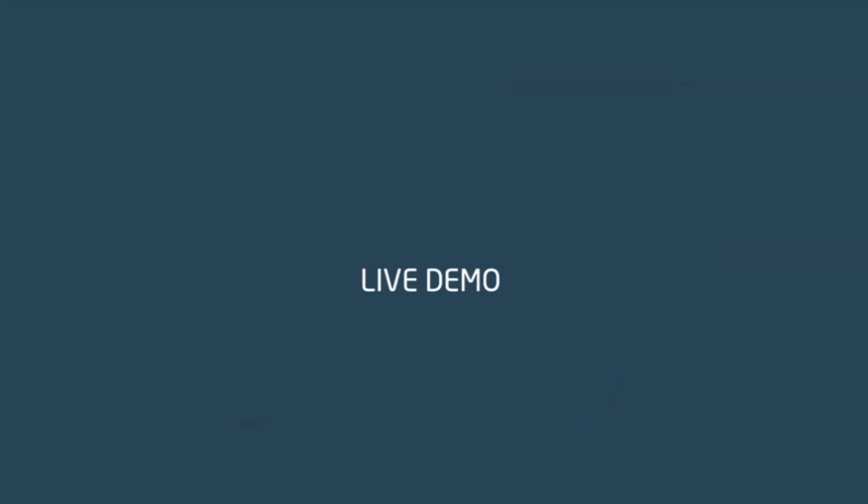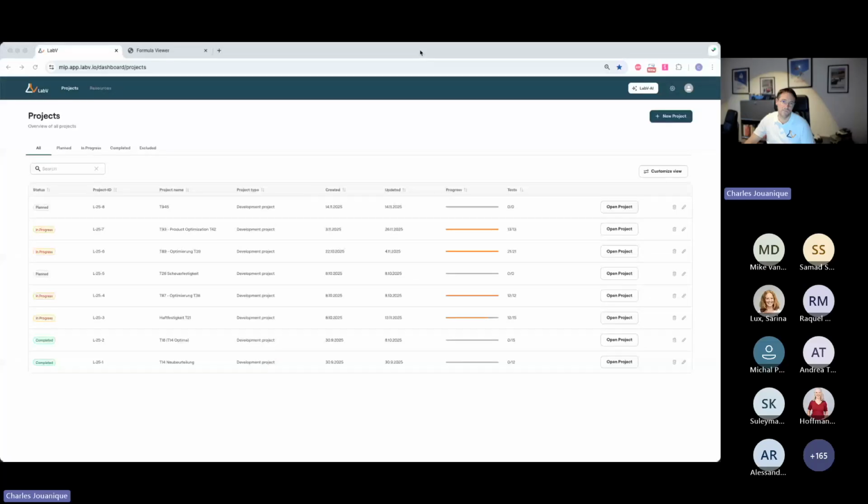And I want to share with you a very brief demo of LabV. It is not an extensive one, but I want to show you how it works. How does LabV work? I have 4 core elements.